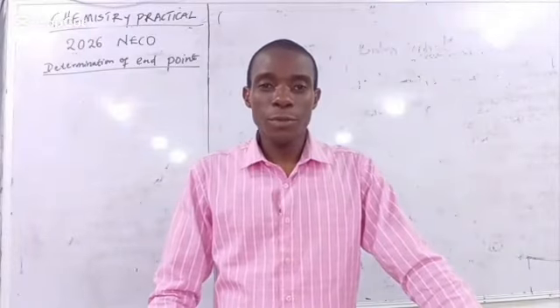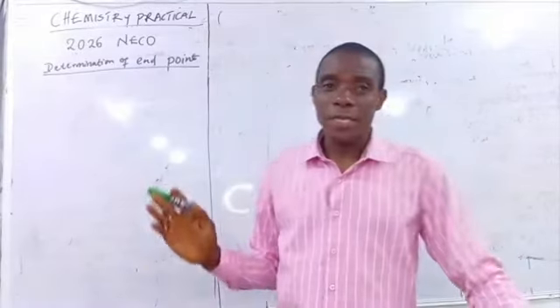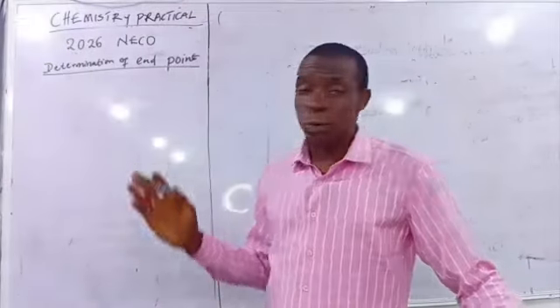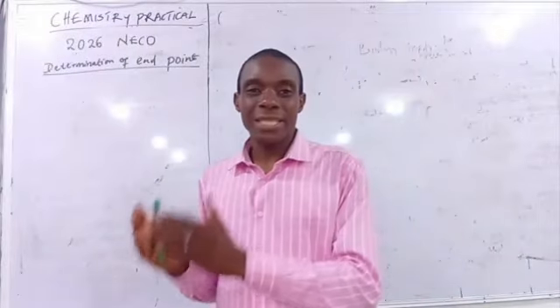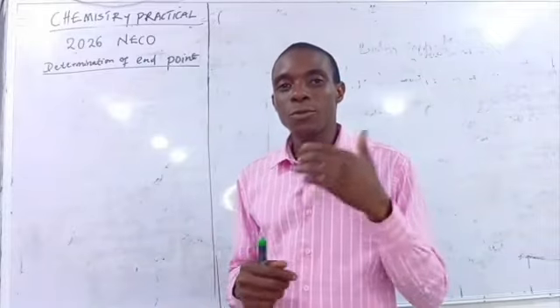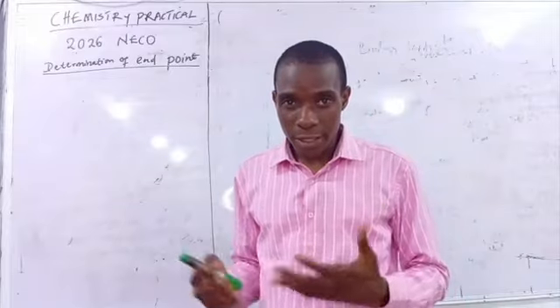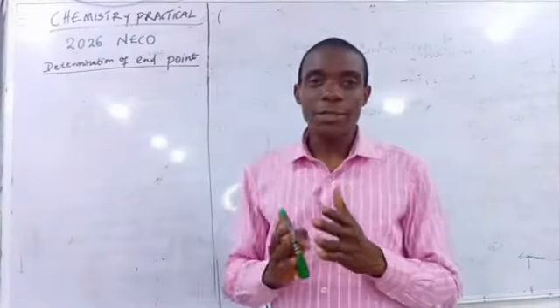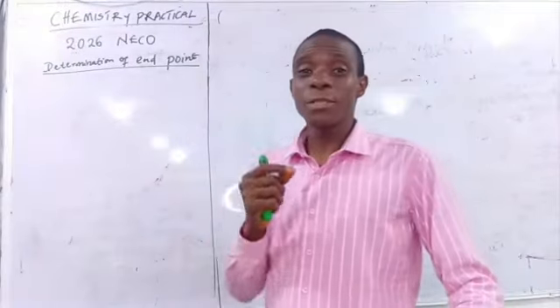Hello, welcome to another session of chemistry practical for 2026 NECO, determination of endpoint. This is on quantitative analysis. This is basically for chemistry teachers who, in your various schools, will be guiding your students to carry out this practical. You need to know how to report your endpoint. How do you determine your endpoint?